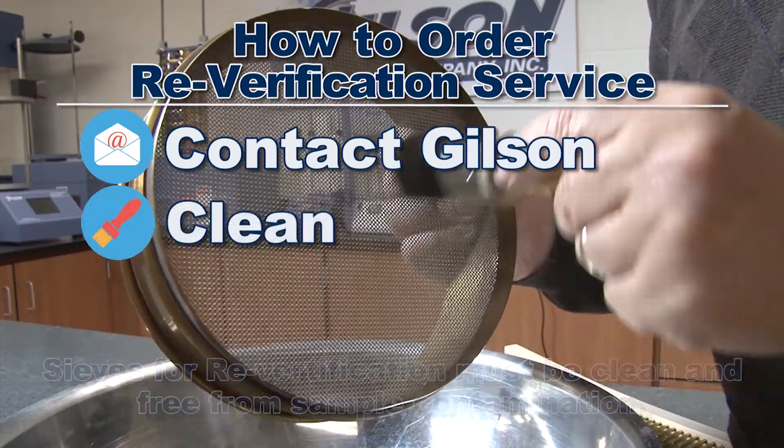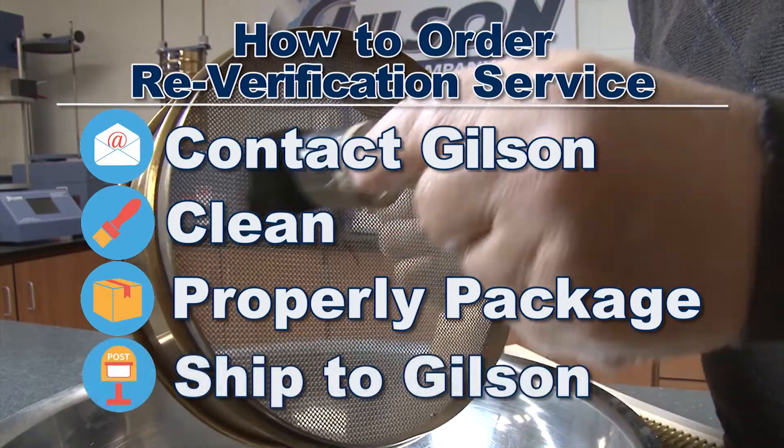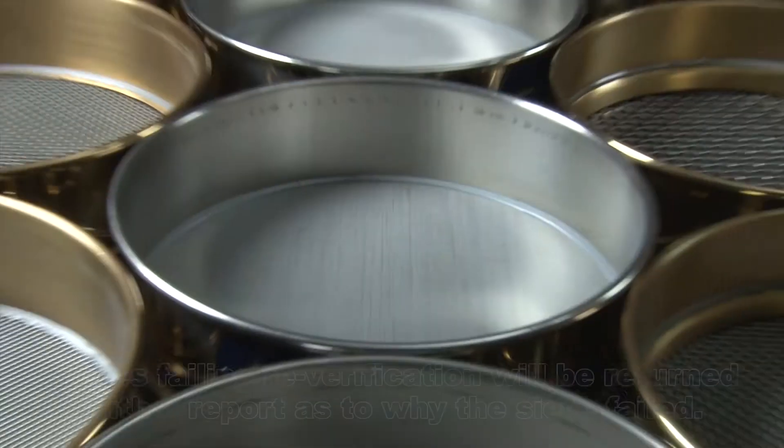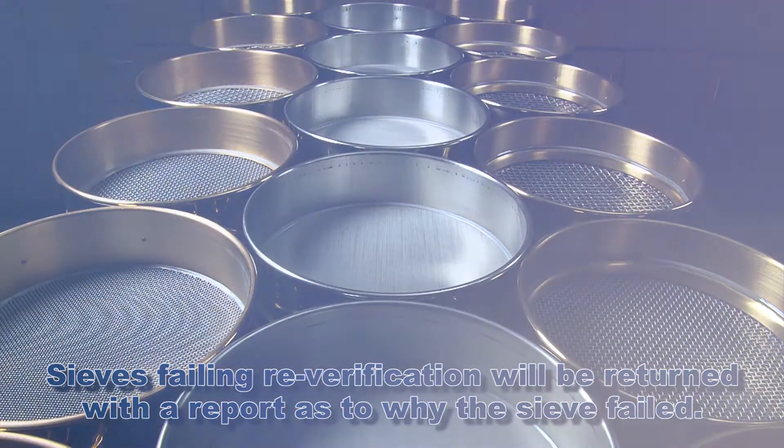Be sure you clean your sieves and screen trays, properly package your units to be tested, and ship them to Gilson. Within several weeks, expect your test sieves and screen trays to be returned with their reverification report.